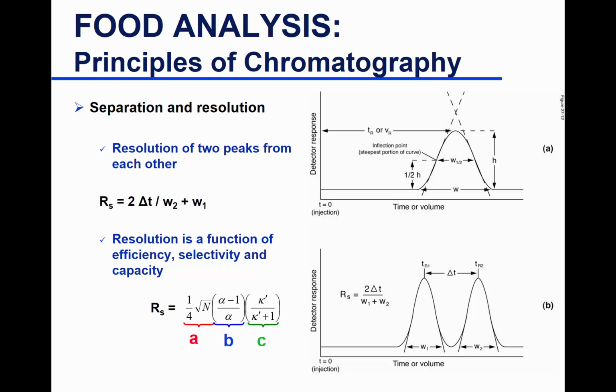So you start off with your compound on the column. It will diffuse down. We'll talk about diffusion later, maybe next time. And then it's going to go in and out as well. So you have equilibrium between the mobile phase and the stationary phase, and then you have diffusion.